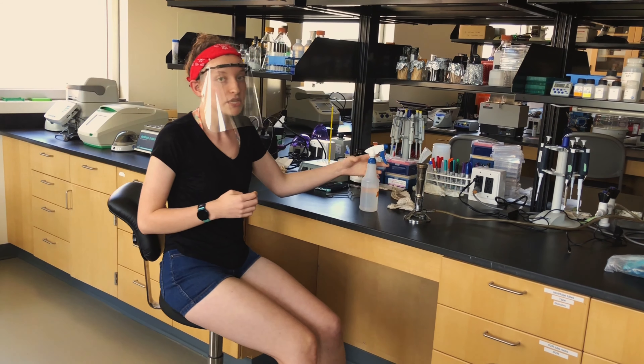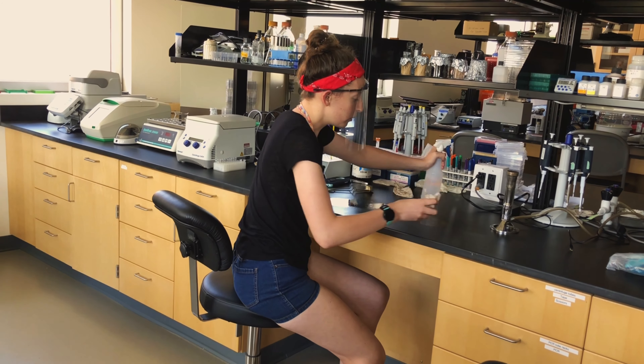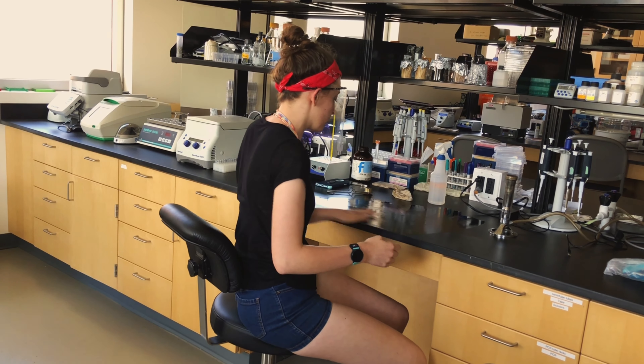After you have put away all of your materials, make sure that you spray down your work surface with 70% ethanol. Be sure not to miss any spots, as this makes sure that it's clean for the next person who uses the work surface.